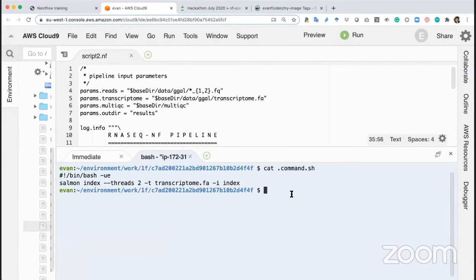We also have the other important one, what's actually executed, what's really going on in the background, the secret sauce to us.